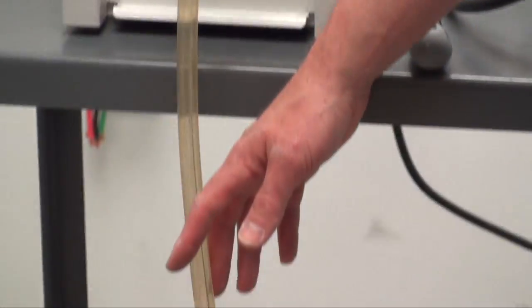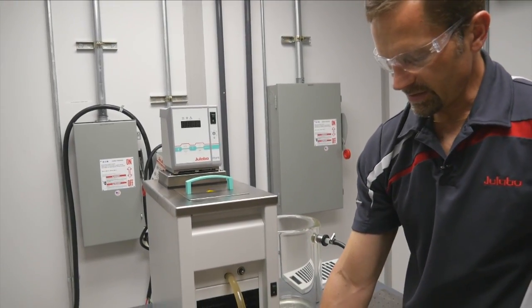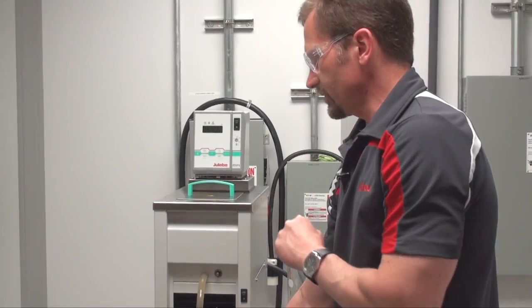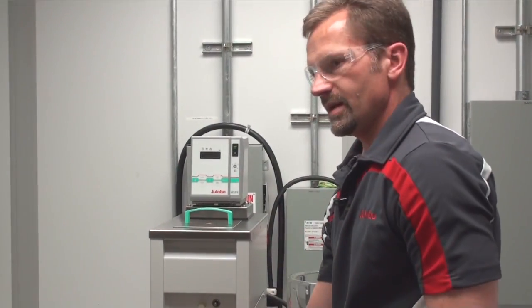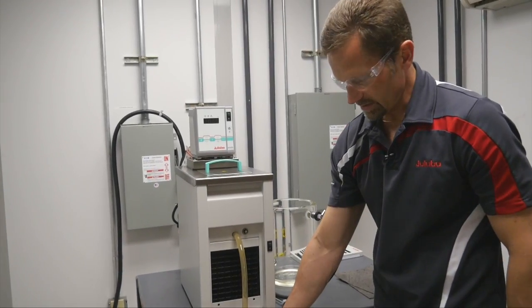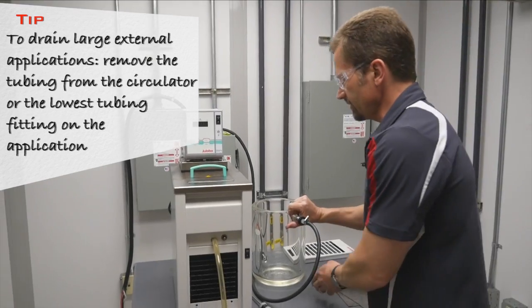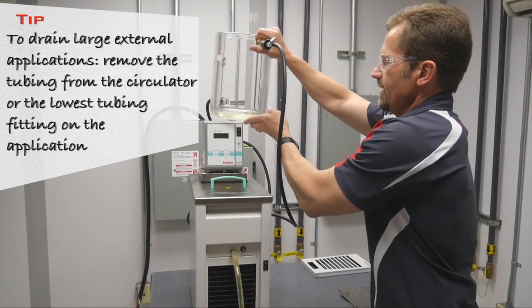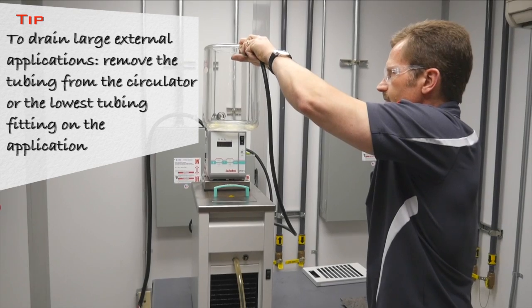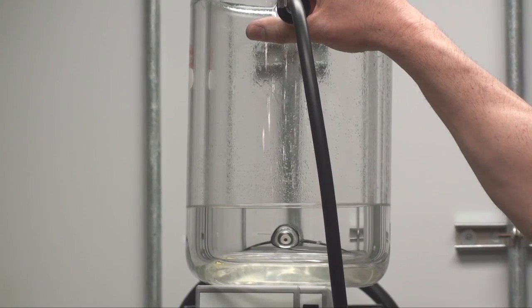Once the bath tank of the JULABO system has been emptied, if you have an external application connected to it, you could either raise the external application above the level of the circulator or remove the tubing on the back of the system to drain your external application. In this case we have a relatively small external application, so I'm simply going to lift it above the circulator and introduce some air. The fluid will drain back into the bath tank and then out into your container.